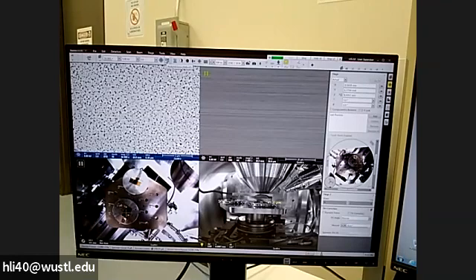If you want to double check the alignment, that's also good. If you don't want to change it to be very close, that's also okay. But if you are trying to do a very high resolution image, it's good to check the alignment, which includes the wobbling. Yeah, it's very good, right? A little bit up, but it's very close. It's acceptable.